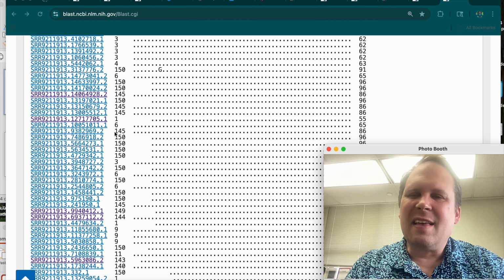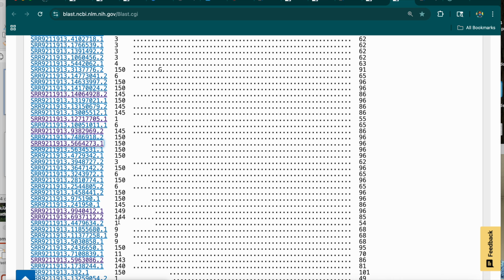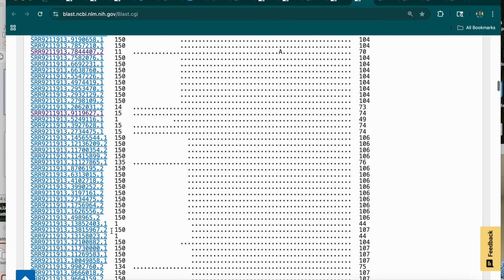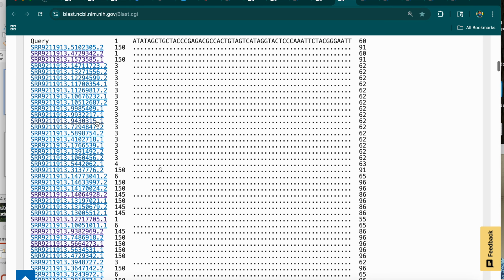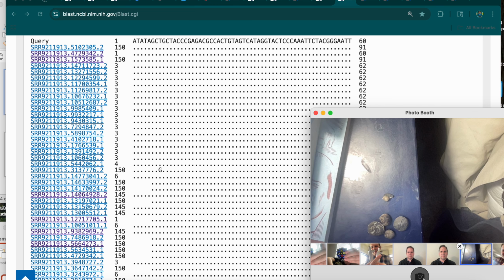It's annoying. So to make sure our chances are as good as possible here, I'll click a 145, I'll click a 150, 149, that's great. 143 is super. 139, cool. And whatever else. So 130, why not? Round it out. All right. Now I can go back and look and see what each of those was. So my first 145 here was a 0.2. And I can say, okay, 0.2 is my reverse read.